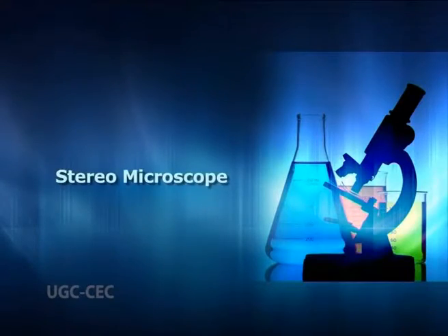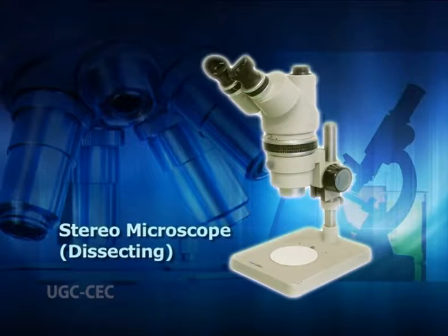Stereo microscope. Dissecting microscopes or stereo microscopes have low magnification power. This is also a type of light microscope that helps in observing specimens that are larger in size. It has a reflection mode of illumination. It contains two optical paths at different angles that help the user see the specimen in three dimensions.